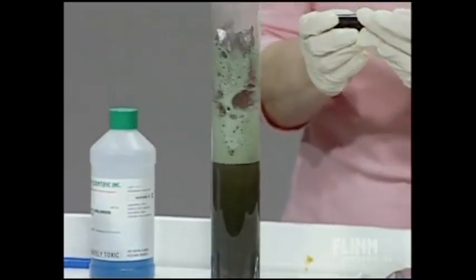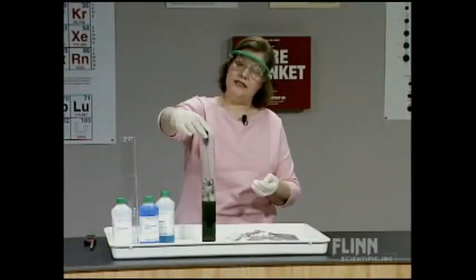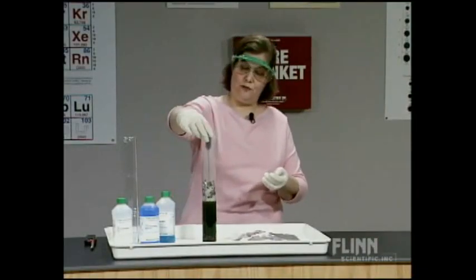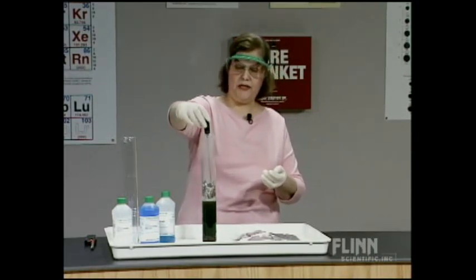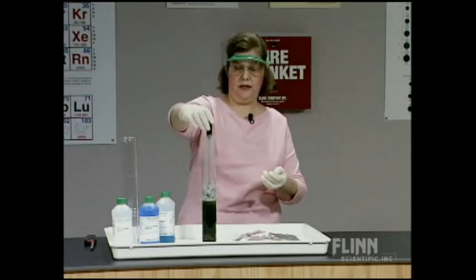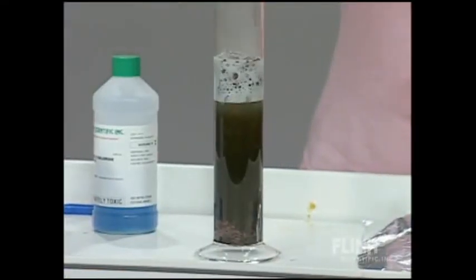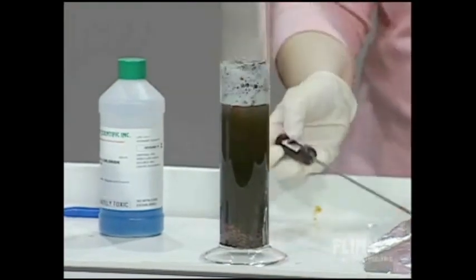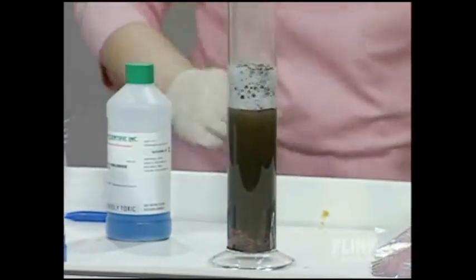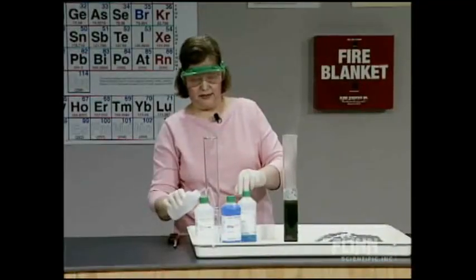We're going to turn on this thermometer. It's in Celsius, and let's see where we're at. We're at 68, 72, 74. It's getting quite hot. It's almost boiling. So we have a lot of observations, clues, if you will, as to what's going on here. In the reaction of copper 2 chloride with aluminum metal, what's going on? I'm going to rinse this thermometer so that that red solid doesn't stay on there forever.